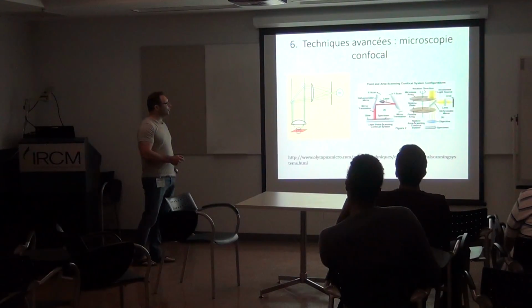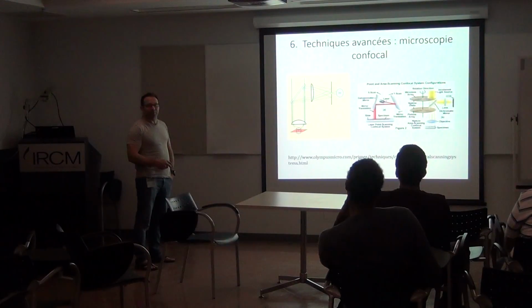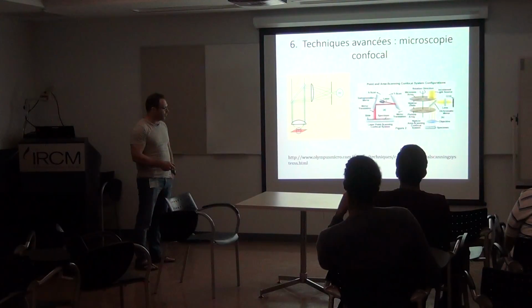And so with a confocal microscope, in one case, you have only one pinhole, and most of the time you use a laser, but it's scanning. So you have a laser scanning microscope. Many of them are called LSM, or laser scanning microscope. So you have those mirrors which will oscillate and make a small point that goes onto your specimen and scans it.